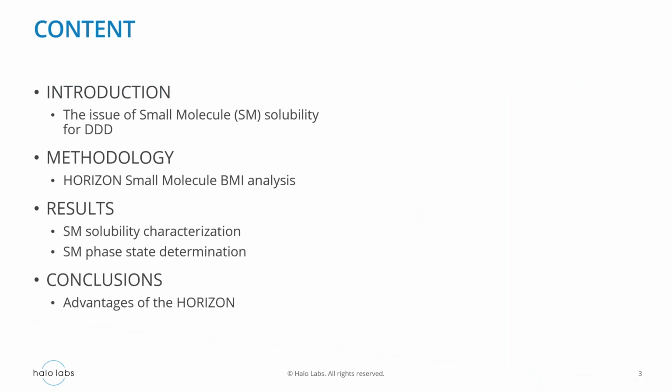Okay, in the content, I'm going to be framing the problem. The problem is the solubility of small molecules and how this affects drug discovery efforts. And then I'm going to tell you about the solution that we are establishing here in the company and how this has been a great aid to many scientists and collaborators already. I'm going to walk you through some of the results we got here at the company. And then for the conclusions, I'm going to pinpoint the advantages of using this instrument for this endeavor.